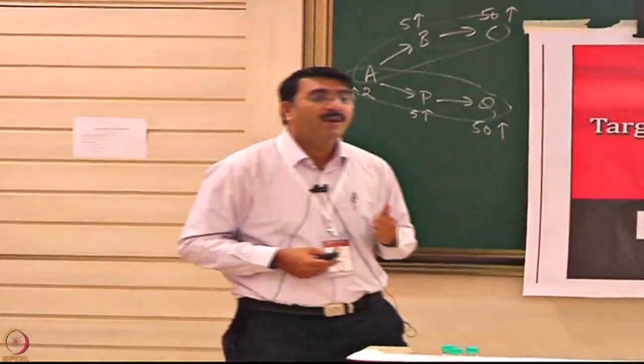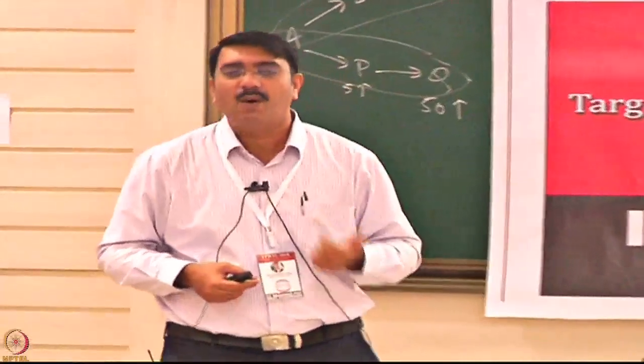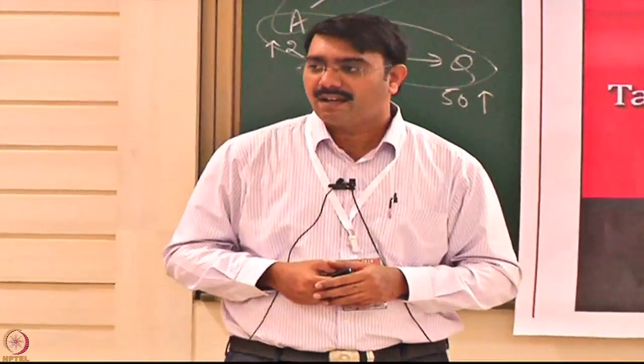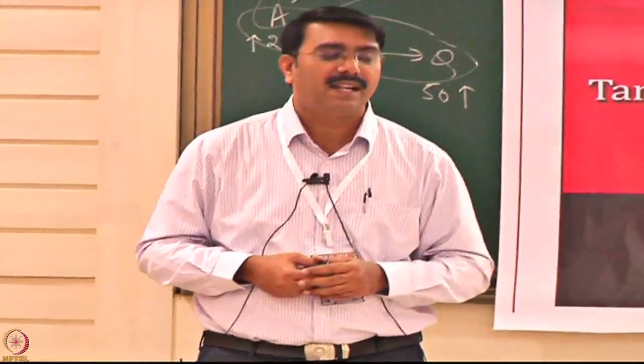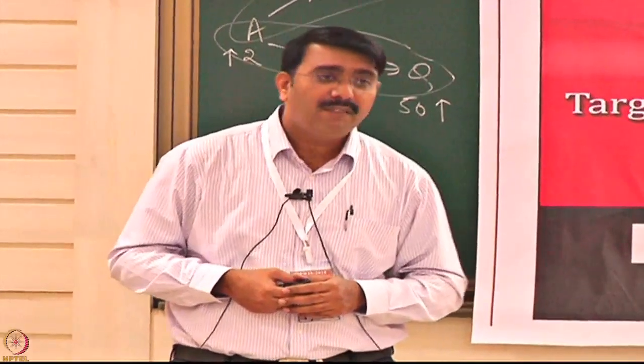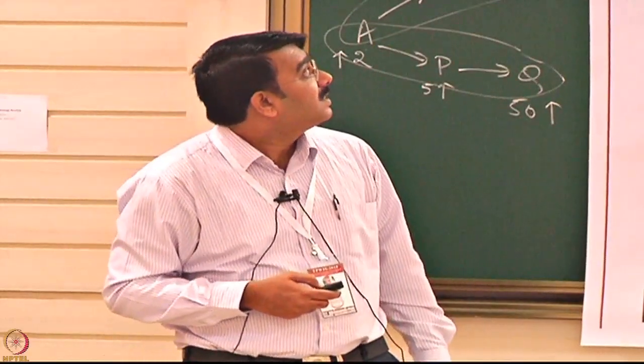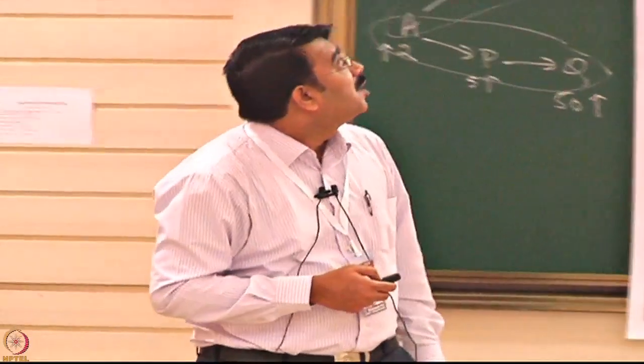But it will not provide you the kinetics parameters, like on rates and off rates. This is the limitation with ELISA or ITC-based technologies.